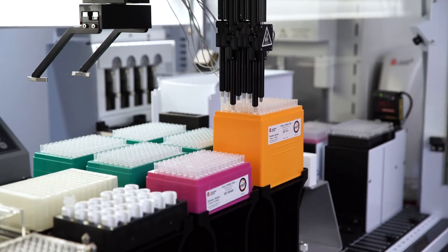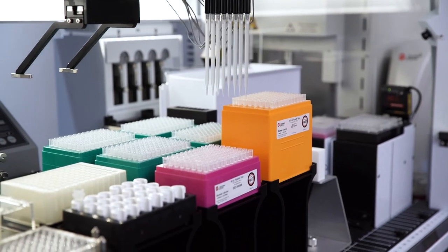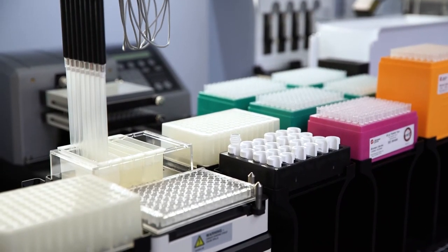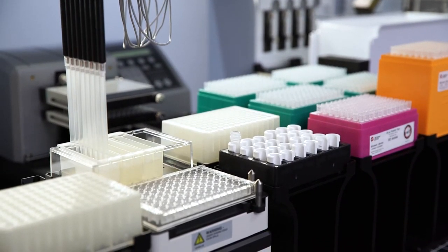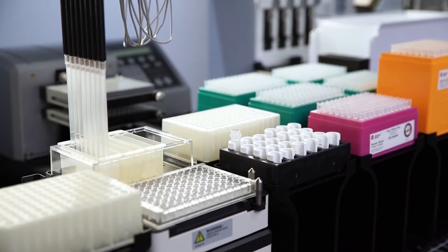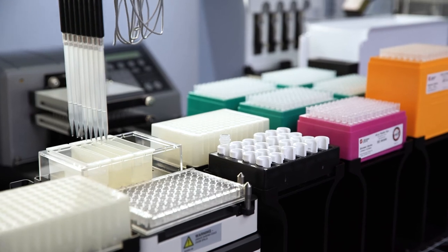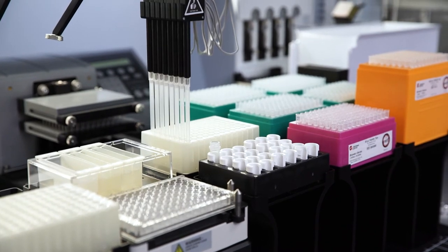Pipetting precision is crucial to the success of ELISA. For instance, an excess of antibody can lead to saturated signal in the final readout. The SPAN 8 pod of Biomech transfers volumes from 0.5 microliters to 5,000 microliters, precisely transferring standards, antibodies, and substrates.